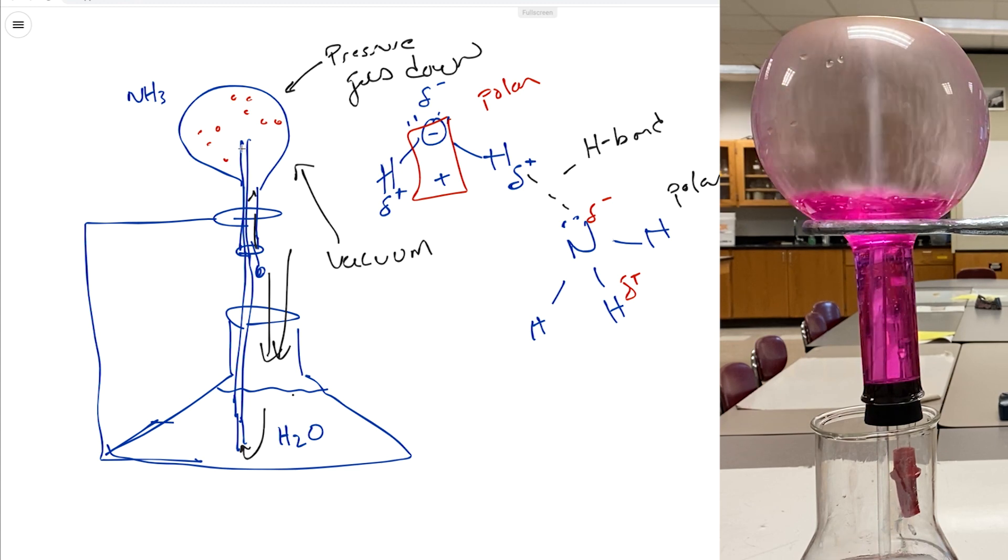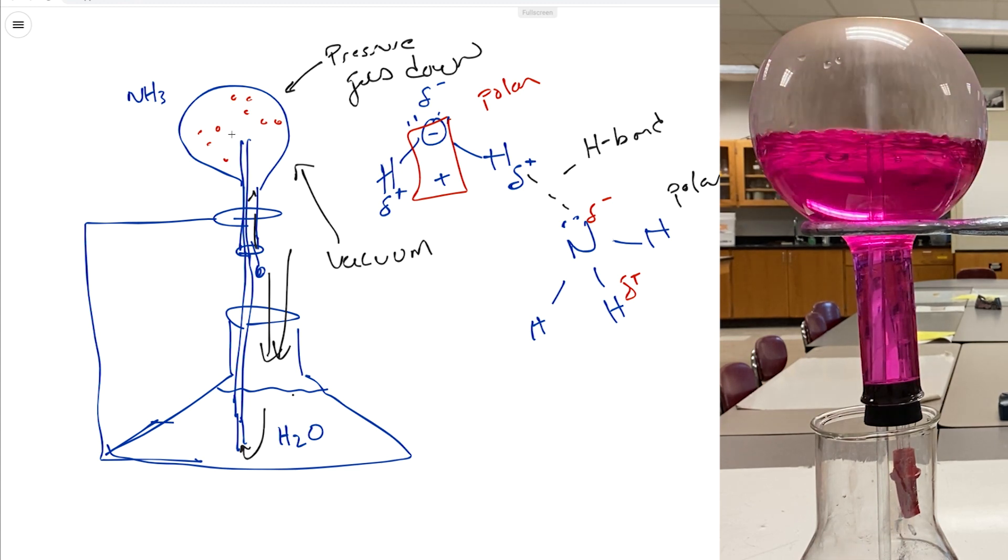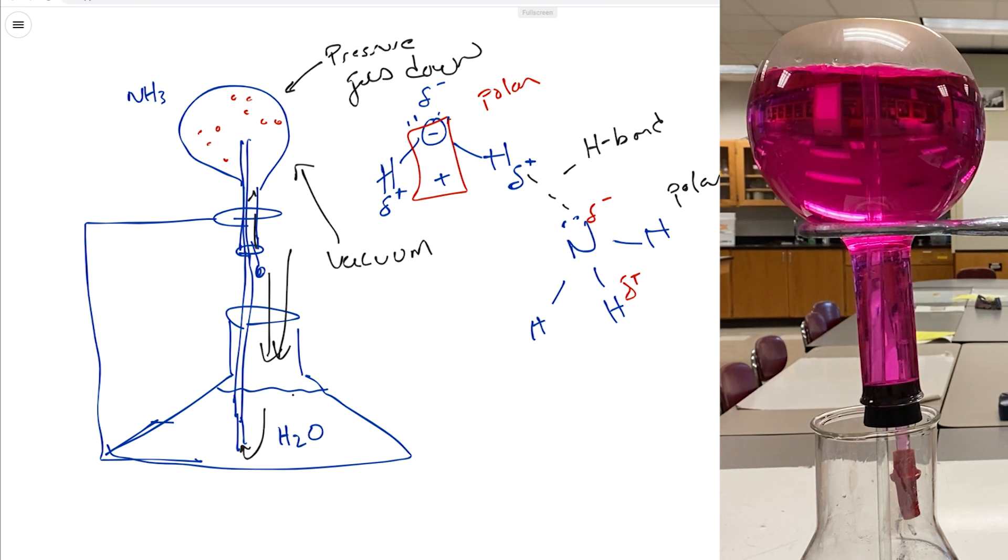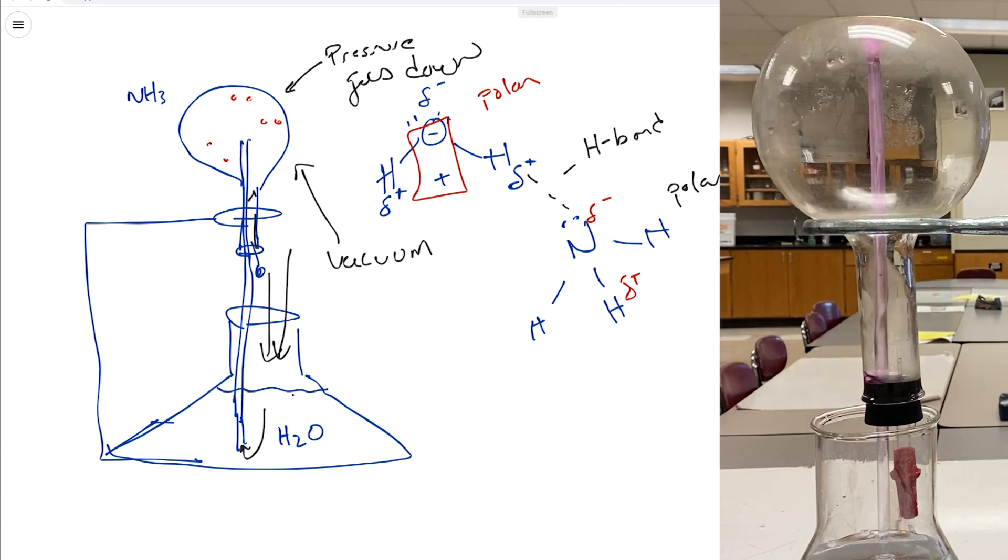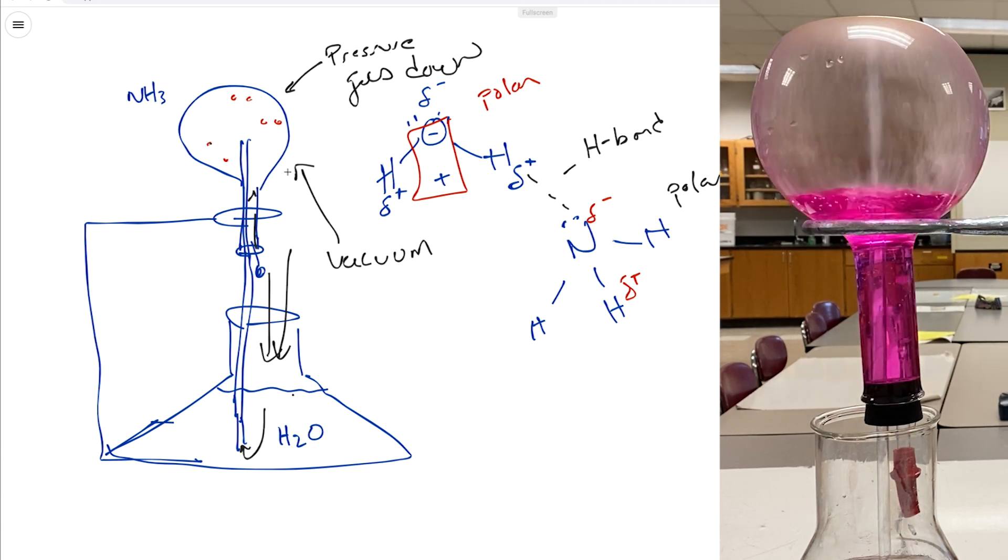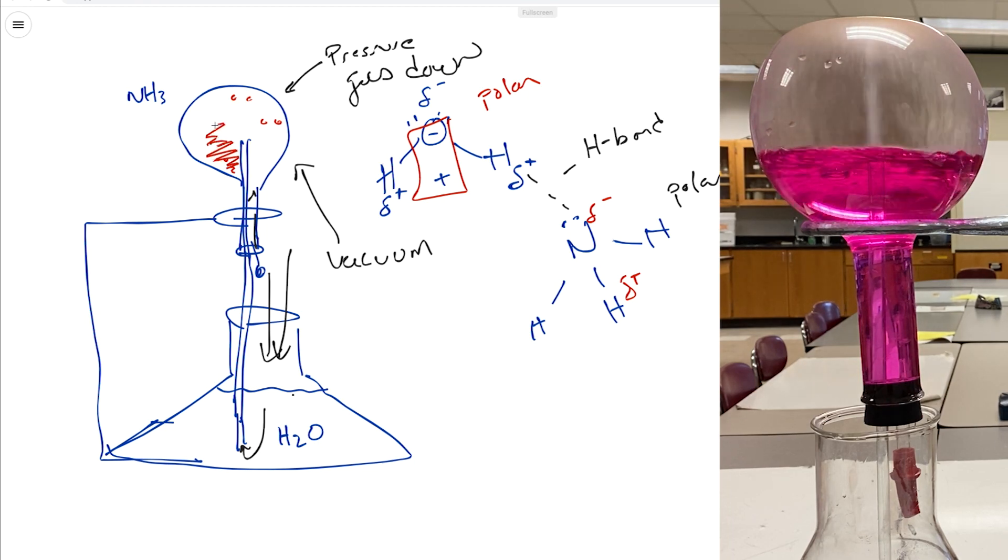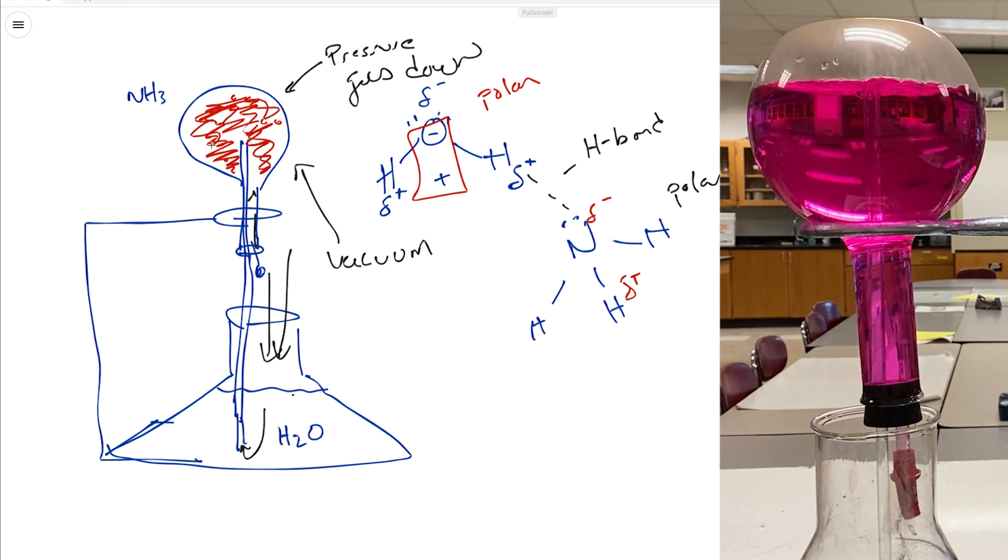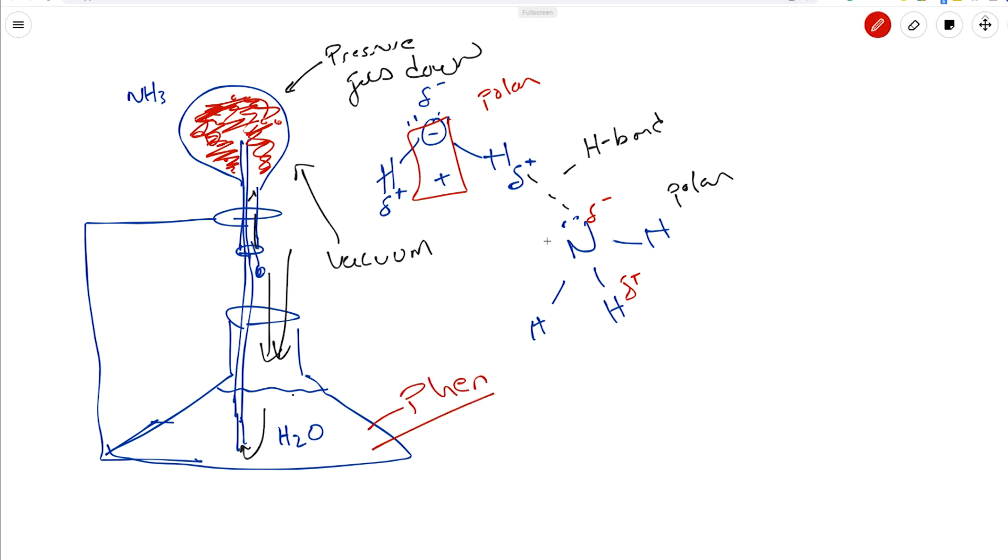Because now there's lots and lots of water for it to dissolve into, and the reds go away fast, fast, fast. And of course eventually this whole thing fills up with the phenolphthalein-embedded water. Remember, there's phenolphthalein down here, and that's how ammonia fountain works.